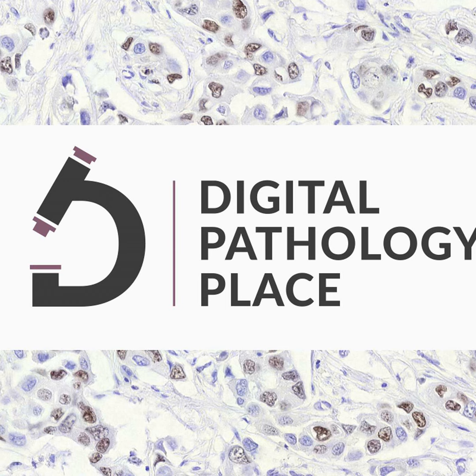So we have the cell segmentation, and we already mentioned a little bit the classification into different phenotypes. Can this be tackled with classical computer vision? We mentioned machine learning. It can be both either a classical or artificial intelligence powered. Is there still place for classical computer vision, or do we need to implement AI for phenotyping?